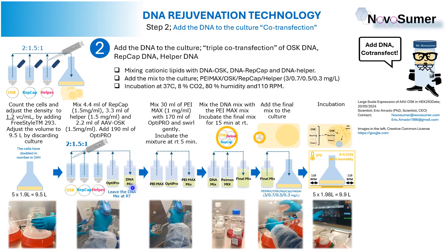You can see here we are transferring. In this picture, you can see how we are transferring the DNA and the OptiPro to a bottle. So now we put this DNA mix aside and we go for another step.